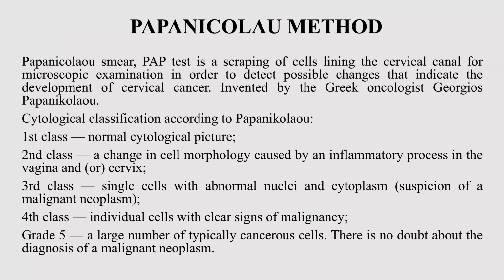A huge breakthrough in cytology was the Papanicolaou method. It's a simple method for screening in gynecology. There's scraping from the cervical canal or cervix and the vagina.